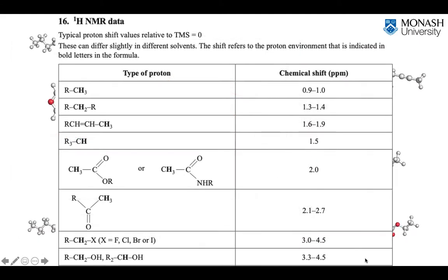So again, turning to the VCE Data Booklet, and I've got about 3 whole pages of NMR data here for proton NMR, you can see the different characteristic chemical shifts corresponding to different functional groups. Now, we've arranged these in increasing chemical shifts. So at the lower values, you can see, once again, there's the alkanes, CH3 groups, CH2. But then as you go up in chemical shift, you can see that we've got some slightly different characteristics.